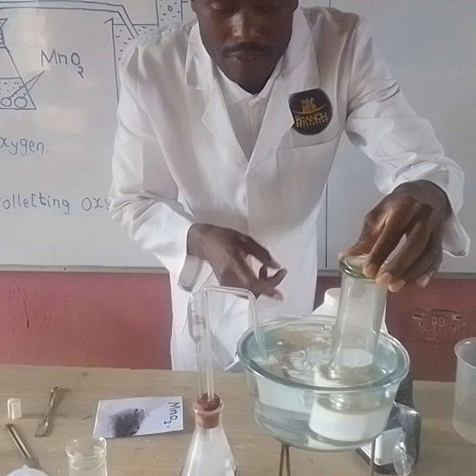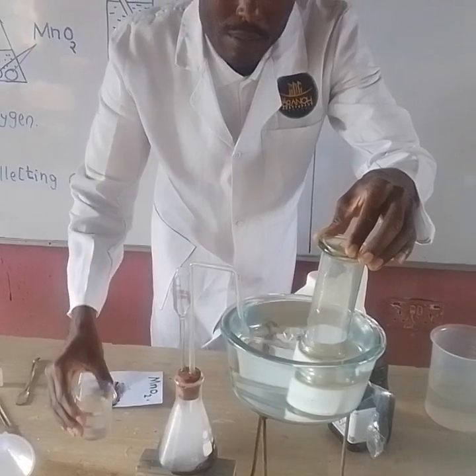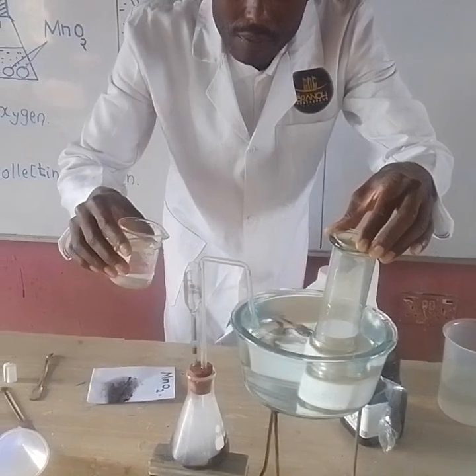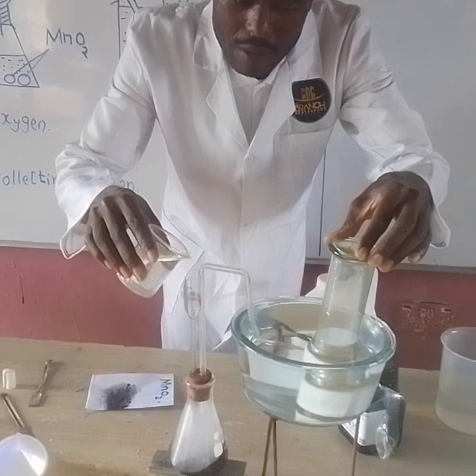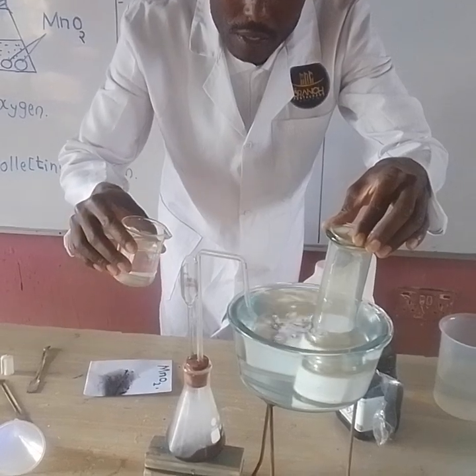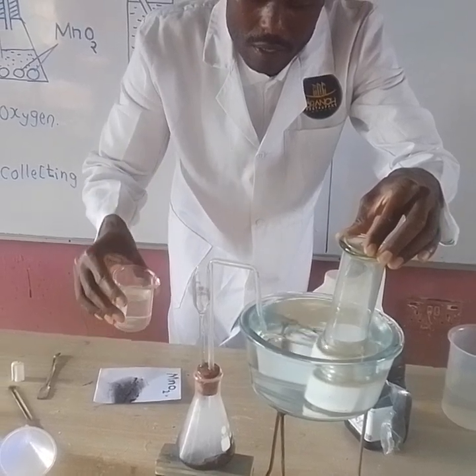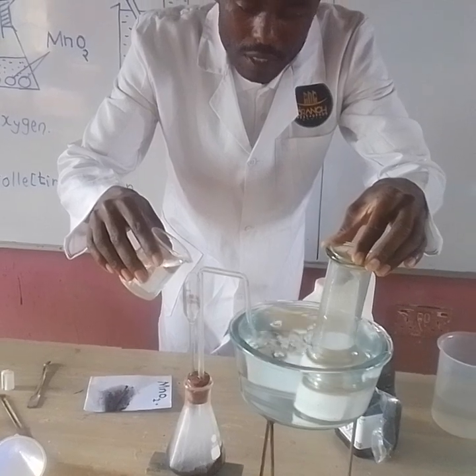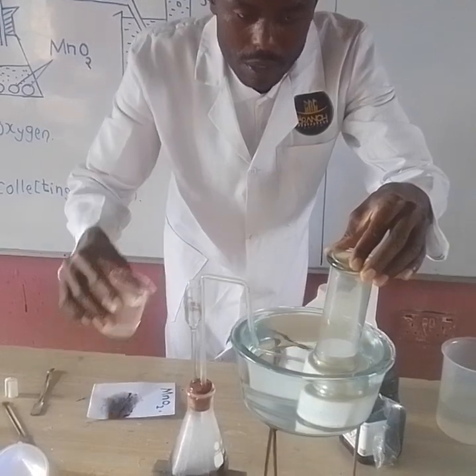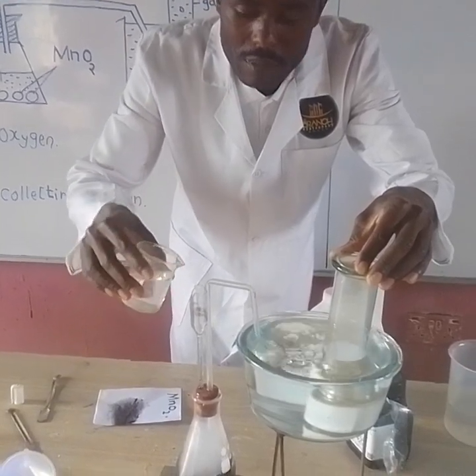See the gas bubbles. When I add a little at a time, you can be able to observe the gas bubbles. Those are gas bubbles. Be able to observe the gas bubbles. Good. Those are the gas bubbles.